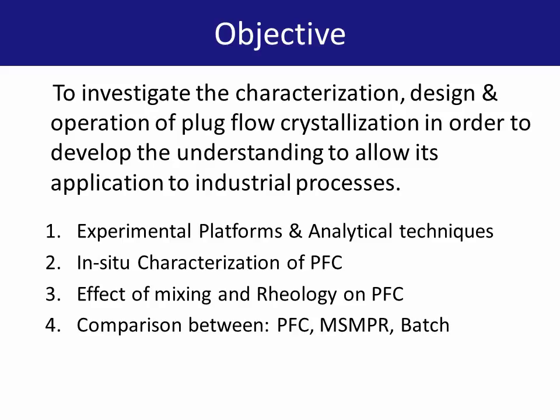Following on from this, I applied these techniques in order to characterize the plug flow crystallization of benzoic acid. Then I assessed the effect of mixing and ancillary rheology on this process, and finally, I compared the performance of the plug flow with the most common alternate crystallization methods in order to get a genuine assessment of its impact.